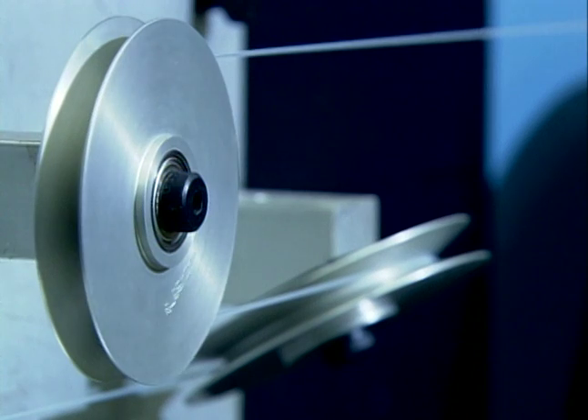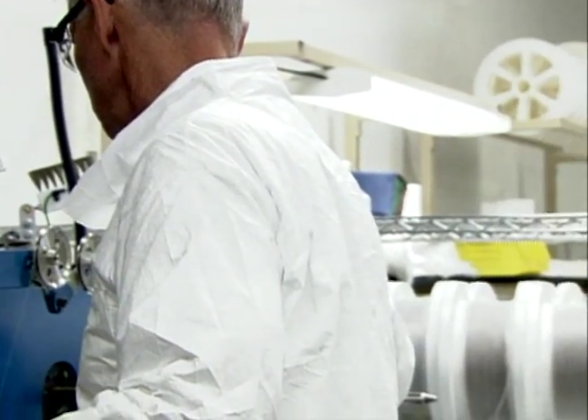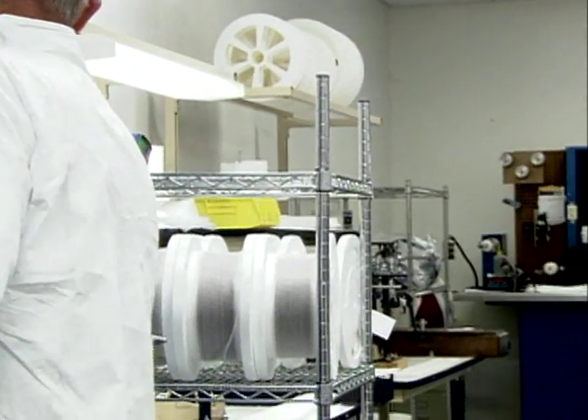Each strand of fiber or capillary then undergoes 100% proof testing to assure flexibility, strength, and longevity. Additional product assurance testing is done in the quality control lab.